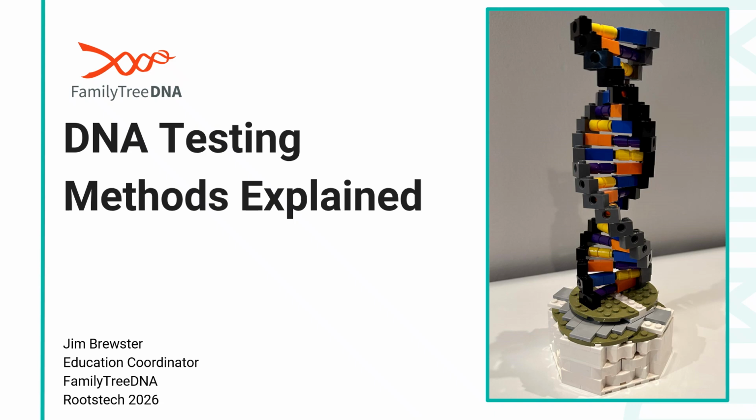Hello, this is Jim Brewster, Education Coordinator at FamilyTreeDNA, and today we're going to be talking about DNA testing methods. These are the ways that we actually take your DNA and we read it, we process it, and we put it into data that you can then use for your genealogy.